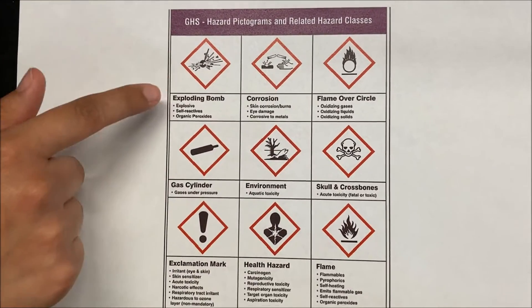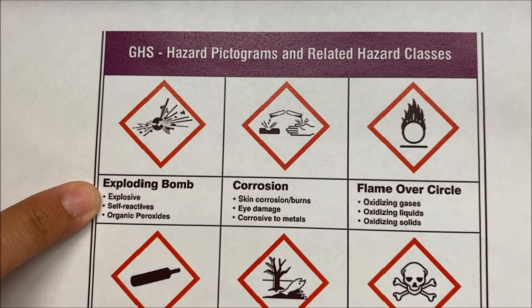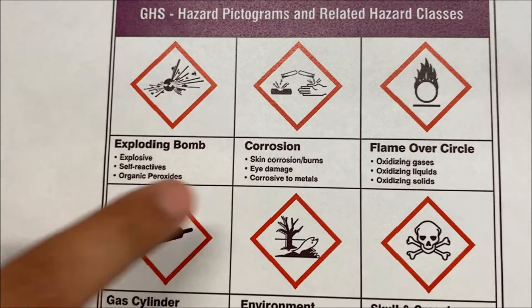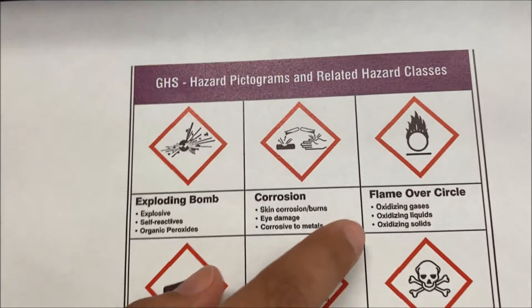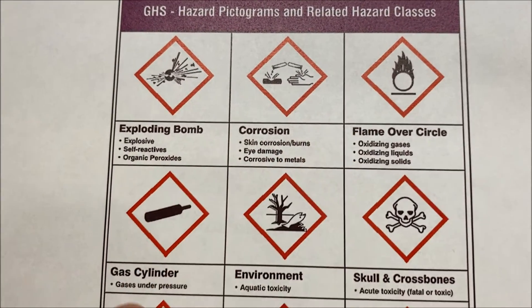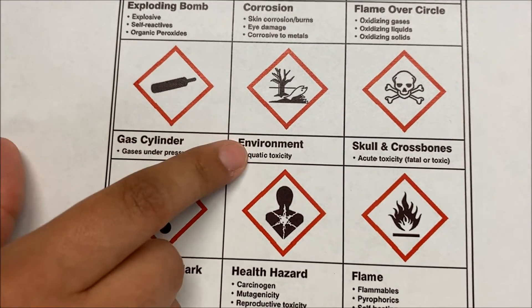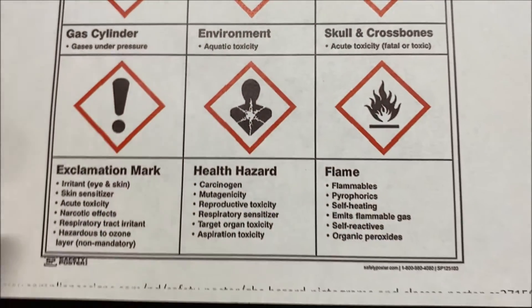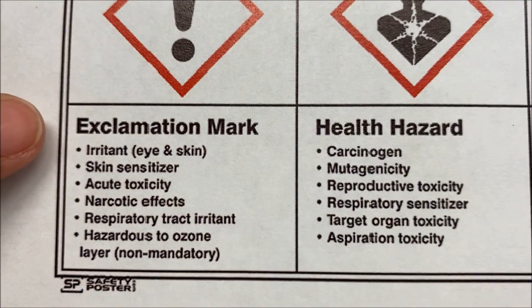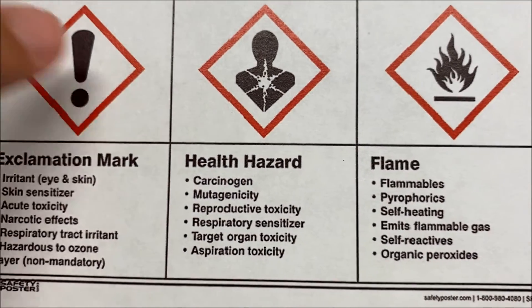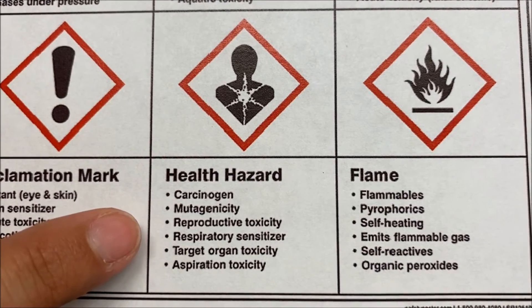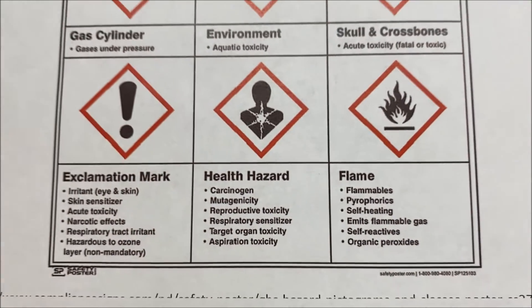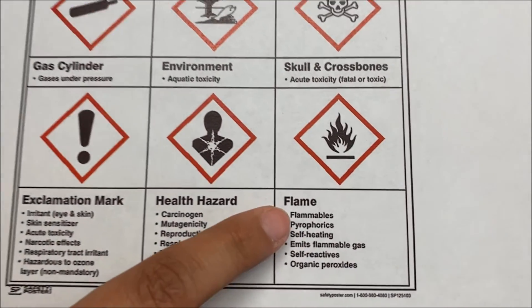More specific hazards within each pictogram: the exploding bomb means explosive. Corrosion is very important — it can cause skin burns, eye damage, or be corrosive to metals. The flame over the circle is oxidation. The gas cylinder shows the substance is under pressure. There is an environmental hazard symbol. The skull and crossbones indicates acute toxicity — either fatal or just toxic. The exclamation mark has specific hazards you can look into further. The health hazard pictogram can indicate aspiration hazard, target organ effects, or multiple other health concerns. Flammable hazards are also included.